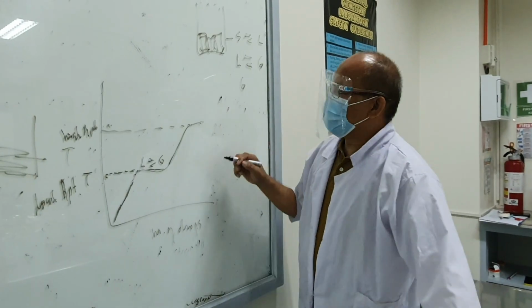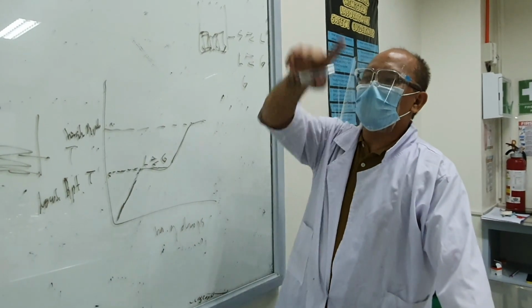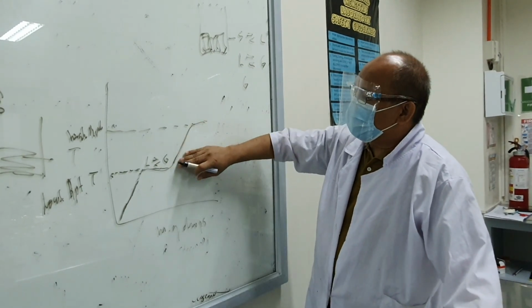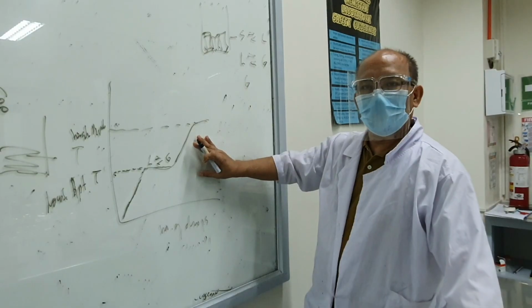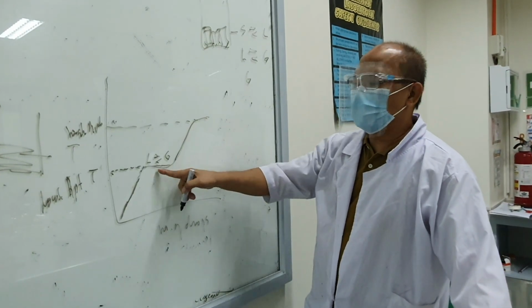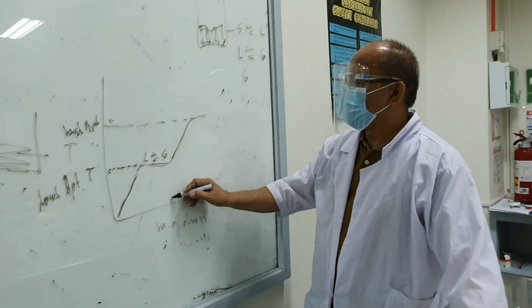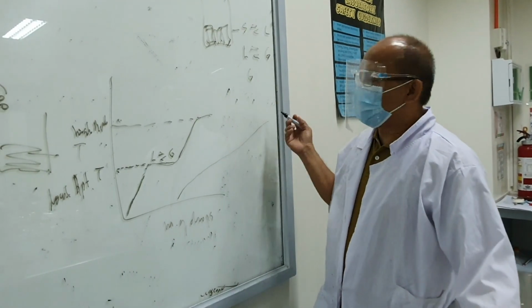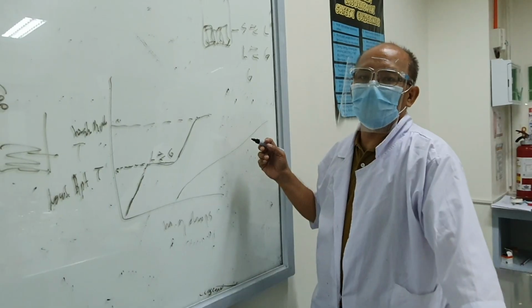For simple distillation, because this is only one run, you might not be able to observe this sharp change in the plateau. In other words, you might be observing something like that, and that is fine because this is an experimental result.